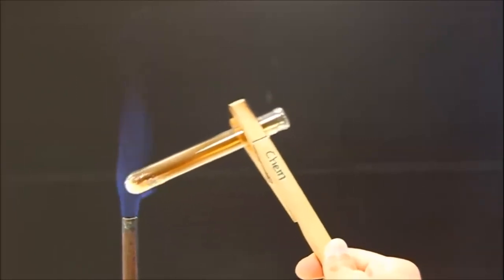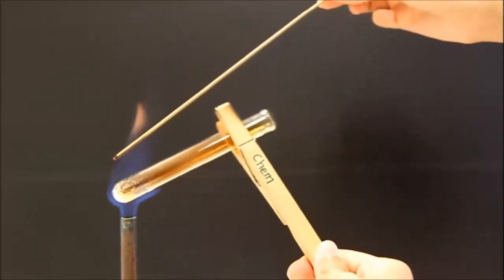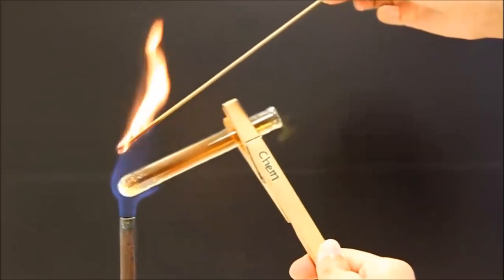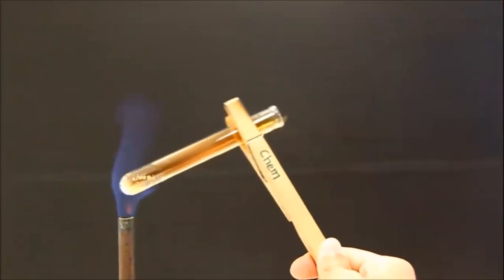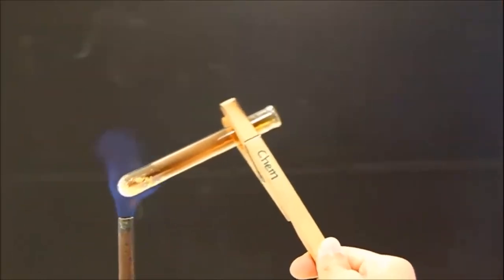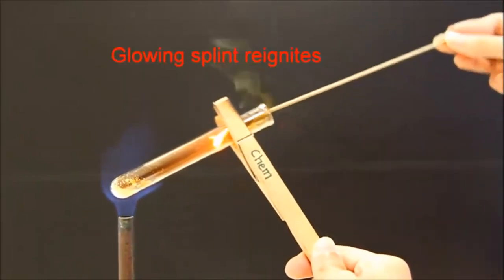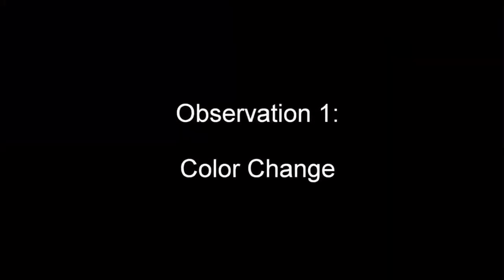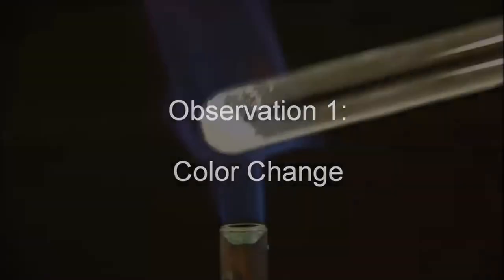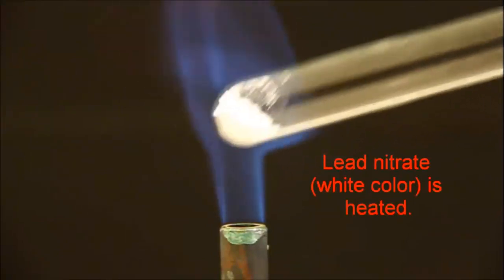even you can see brown fumes being observed from the test tube. And you can observe one more technique here, that is the glowing splint. It reignites, that means it catches fire. I hope all of you know which particular gas helps in combustion. That is oxygen. So what is the first observation that we make? The color change.